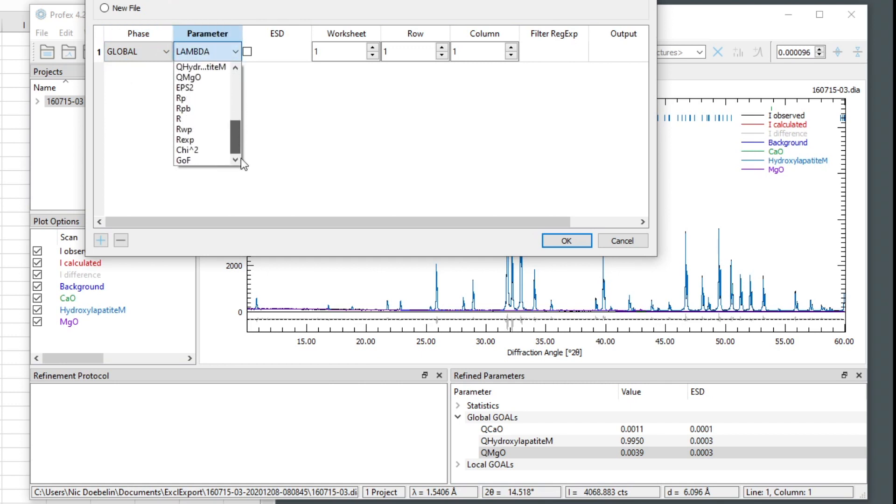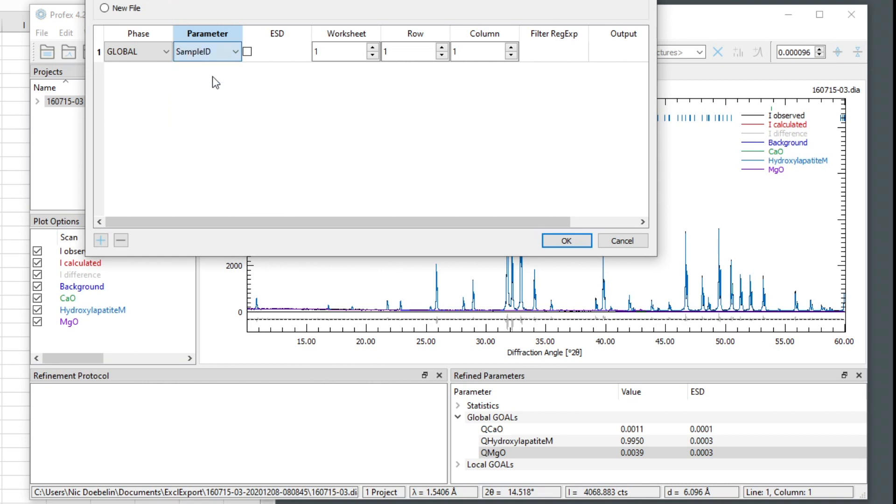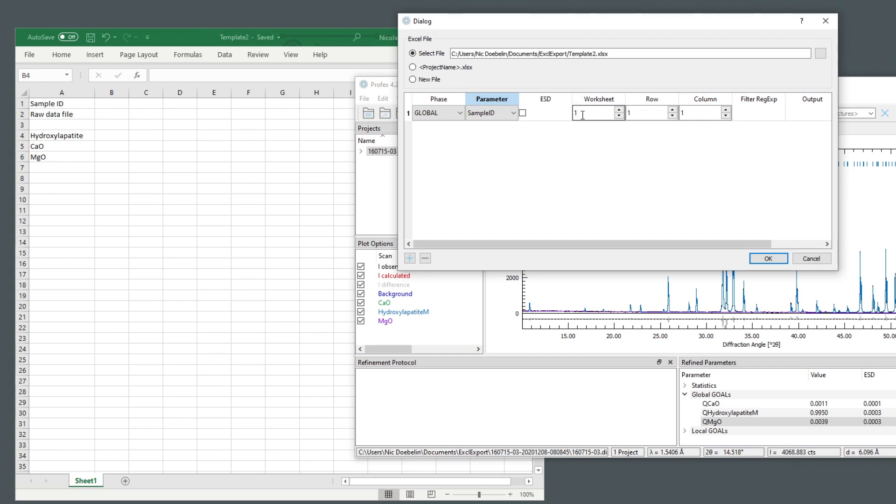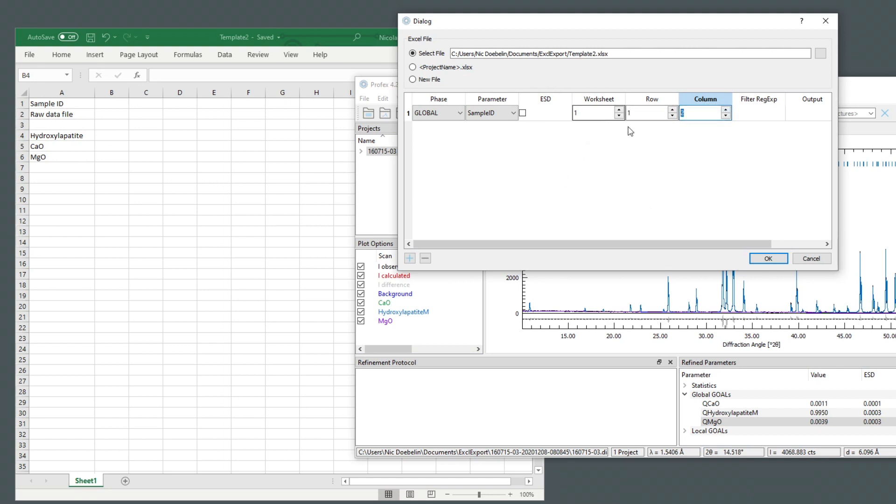There's a predefined list of parameters we can choose from. So we select sample ID. And we want to export it to cell B1 of the first worksheet. We could have multiple worksheets. So we are in the first worksheet. We want to select row number one. And the column is not entered as a letter. So we cannot enter B, but we have to count. It's the second column. So worksheet one, row one, column two is this cell here. This is where the sample ID shall be written to.